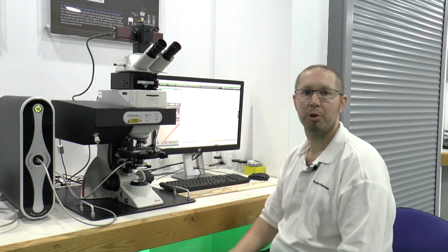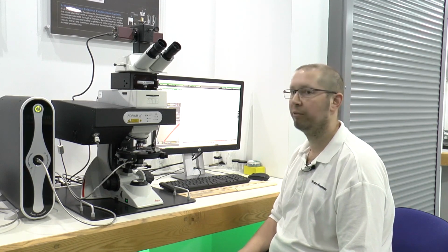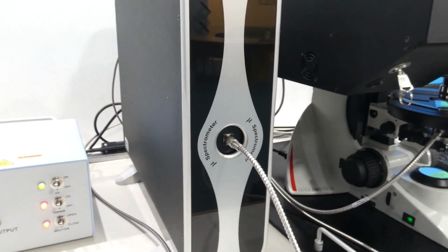Here we have the Foster + Freeman ffTA, the trace evidence analysis system, and we're going to be using the UV-Vis NIR microspectrometer module to examine the textile fibres, and we're going to use the VSC style imaging suite to examine the suspected hairs, where we can do some annotated measurements and overlays to help us with our comparison.